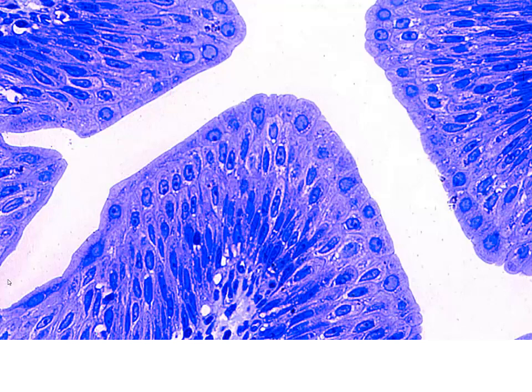Here, looking more closely, we can see the fairly large, here's a nice dome-shaped cell, part of our transitional epithelium. Looking along, see if we can see any binucleated cells. Again, possibly a binucleated cell there. But these very large cells on the surface, that's going to be typical of what we'll see with our transitional epithelium.